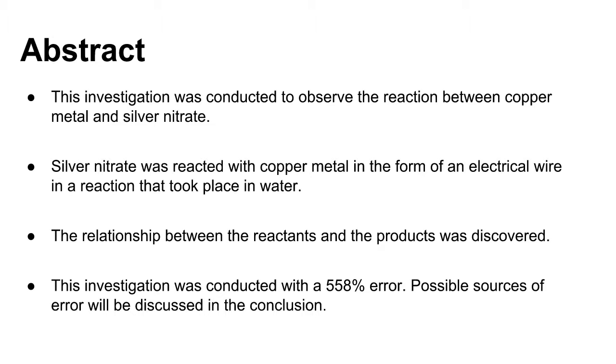Masses of the reactants and the products were measured, and using stoichiometry, the relationship between the reactants and the products were found. From this, a chemical equation for the reaction was formulated. This investigation was conducted with a 558% error. Possible sources of error will later be discussed at the conclusion.